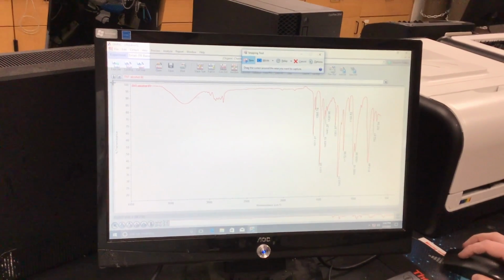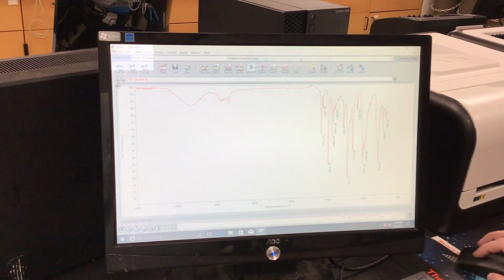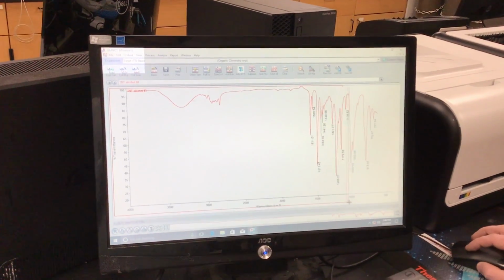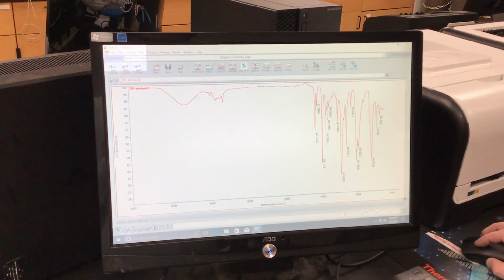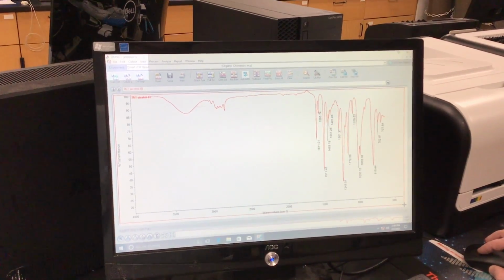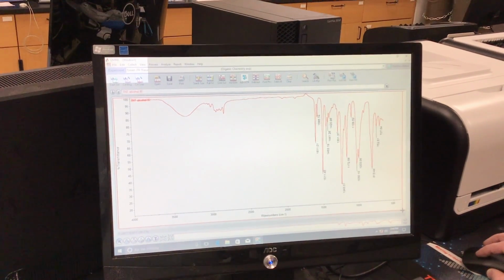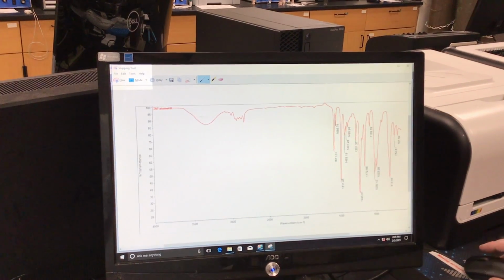You can line up the cursor with the top left corner or top right, any corner, it doesn't really matter, it's your preference, and then open it up all the way to capture all of the edges of the IR. Now this is where you have to be kind of careful. You have to make sure that you get both axes and their labels, and also not cut off any extra info. So I'm taking an extra second to make sure that I get everything on the screen in the right way. And then once I'm done, I just let go of the left click.